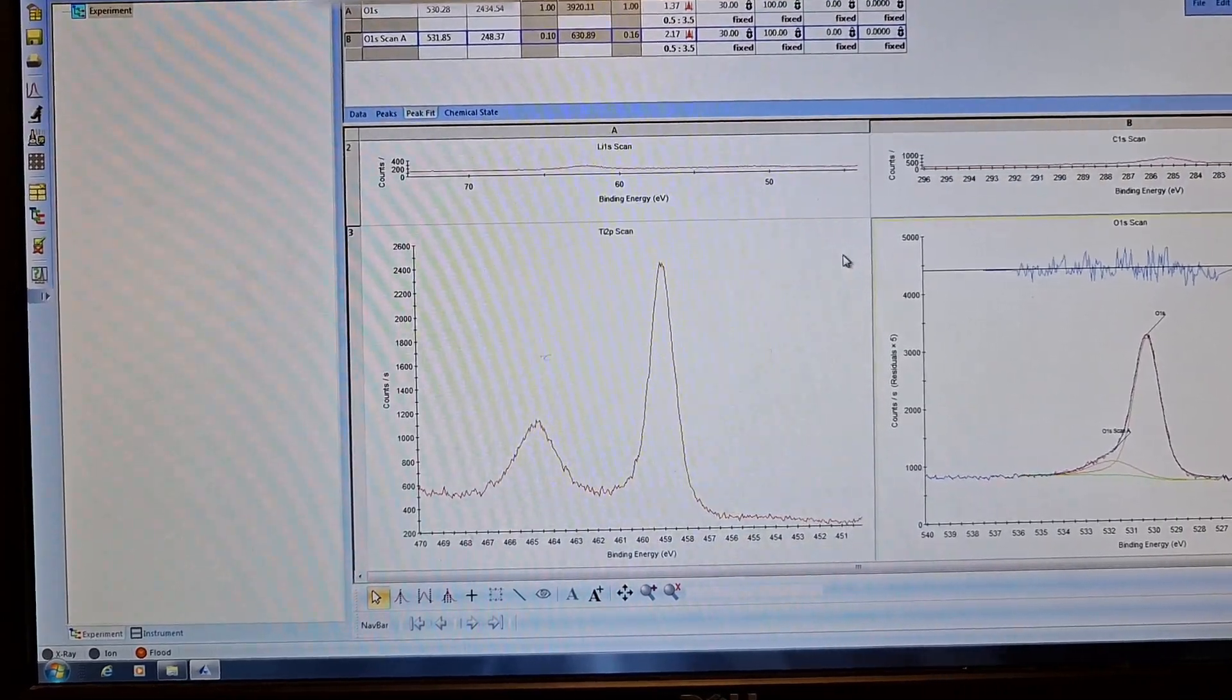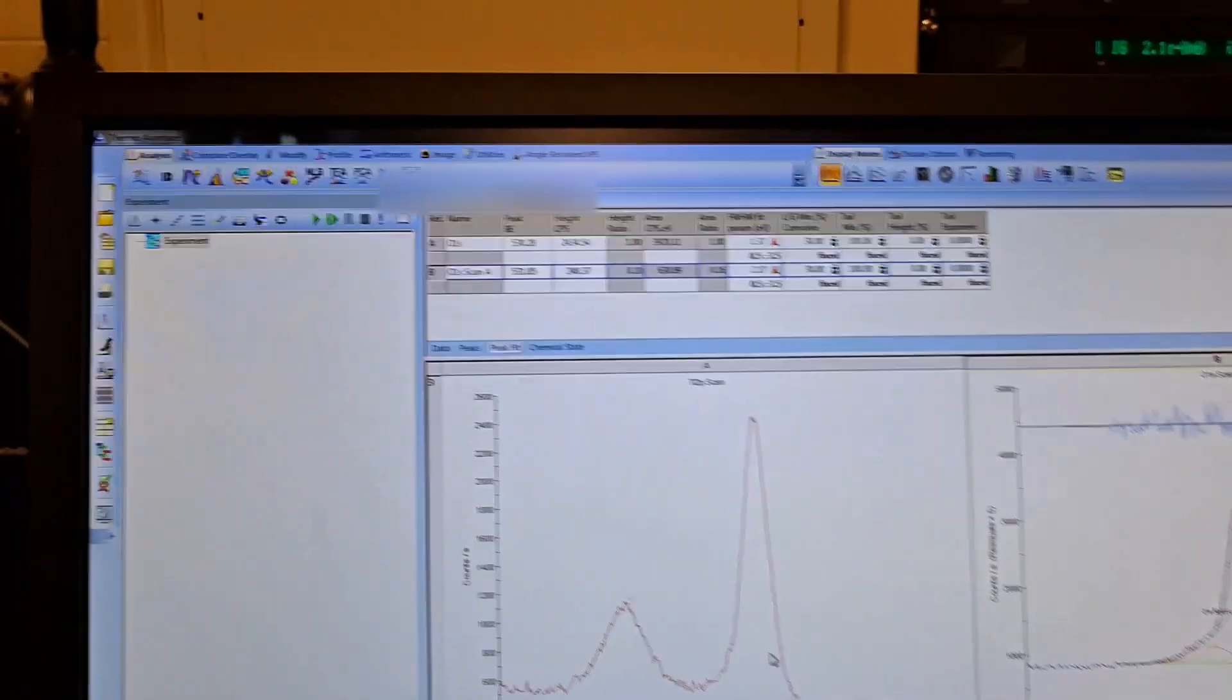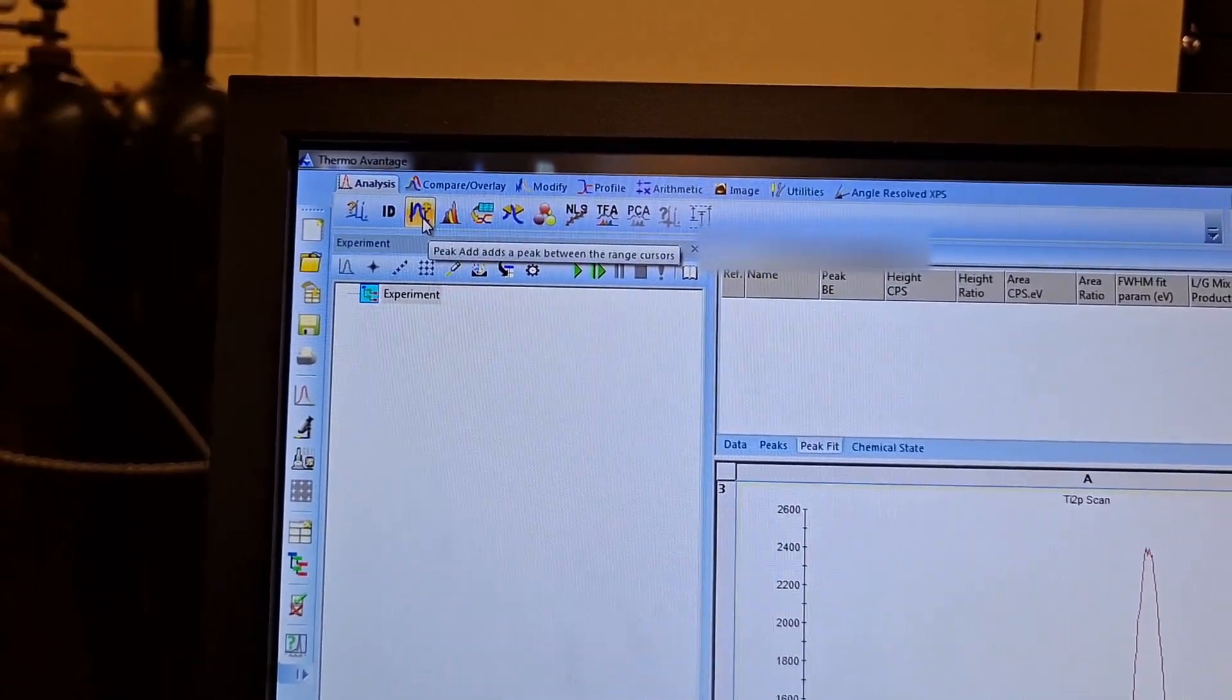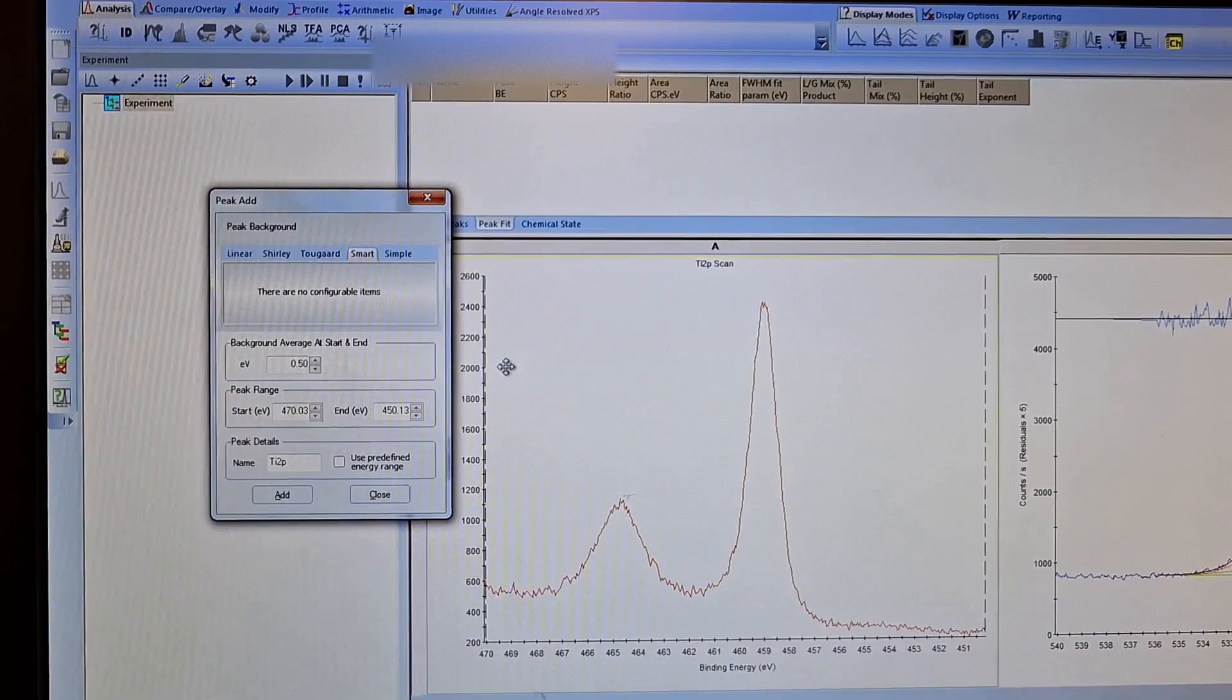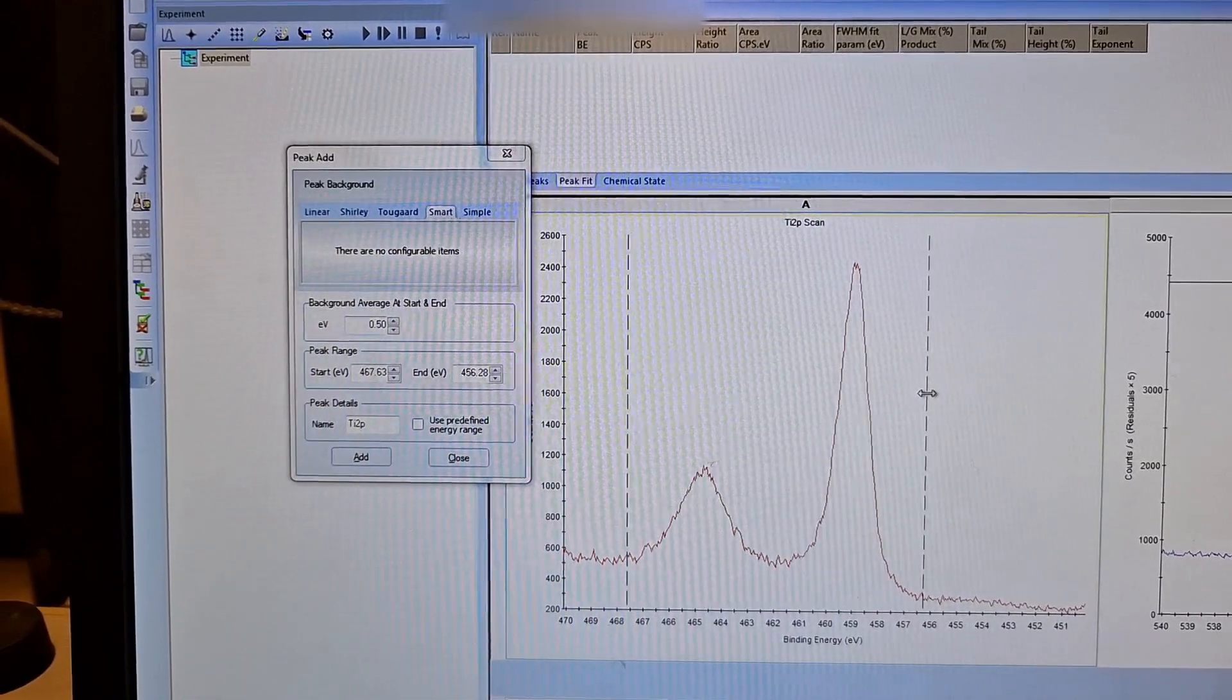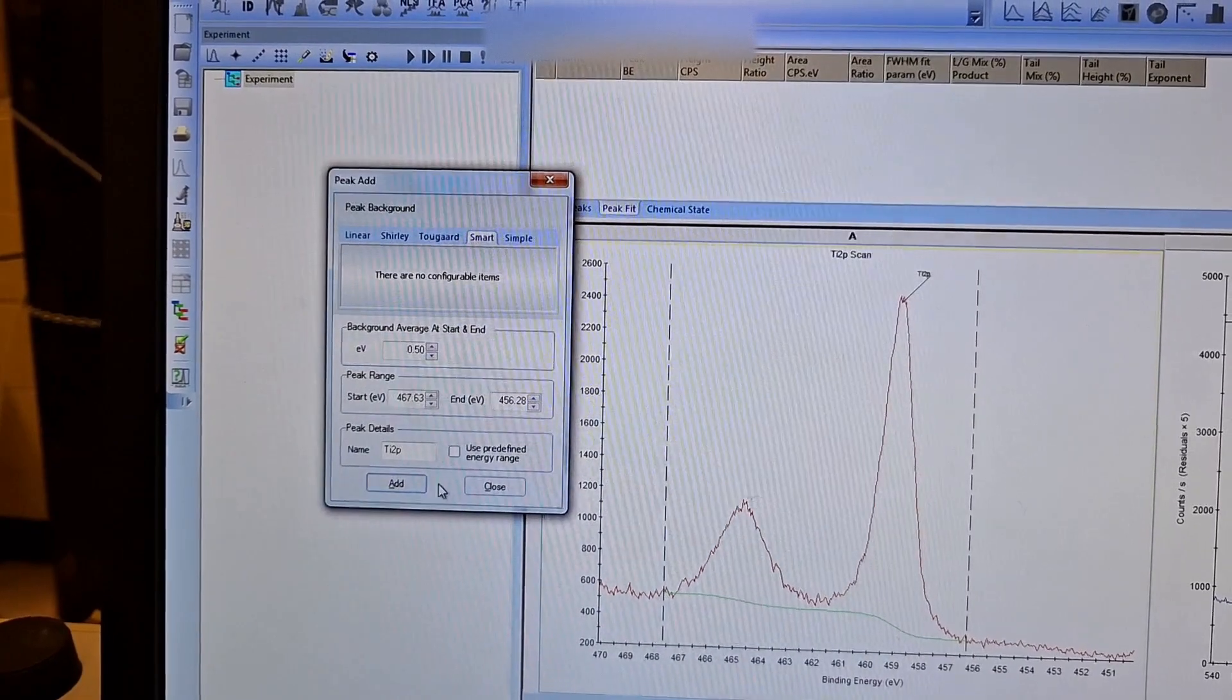I can continue with titanium 2p. Here it is a little harder. Firstly, again I will select the data. I have to right-click on the data and click background. Maybe I should bring it here. I can move these two columns to select the background start and finish positions. Again, I will use smart and say add. It added the background.